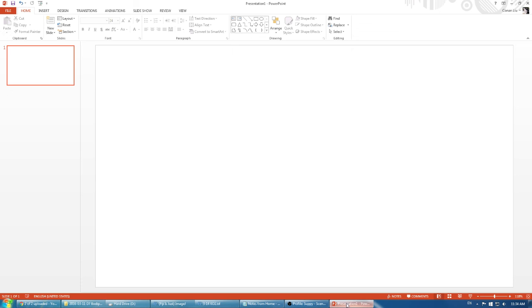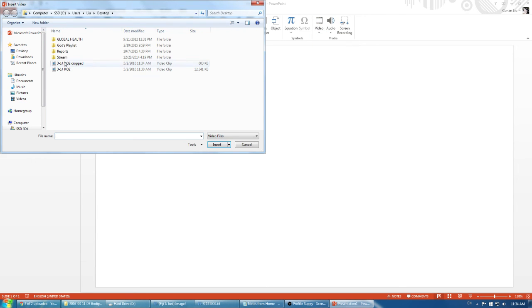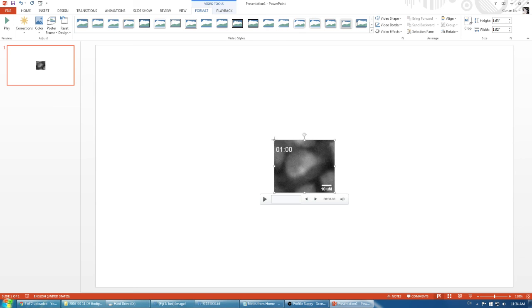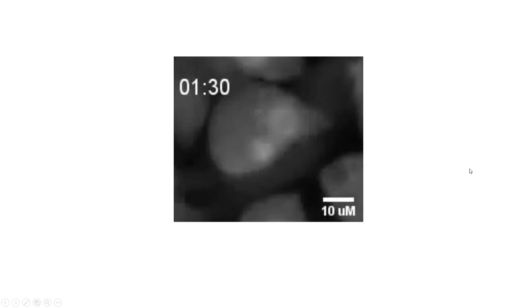We can go to our PowerPoint presentation, Insert, Video on my PC, KO2 cropped, and now you see we have the finished product, which is still going to work perfectly with the timestamp and the scale bar in your PowerPoint presentation.